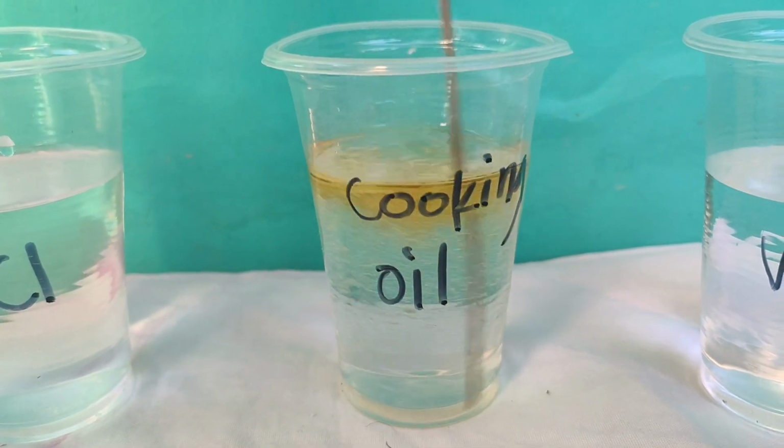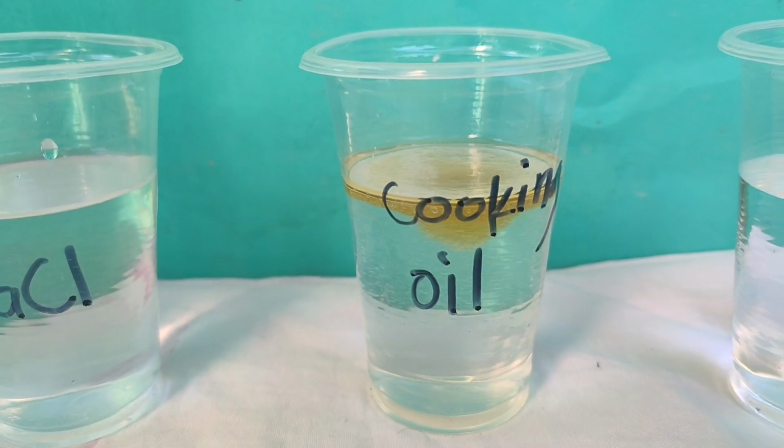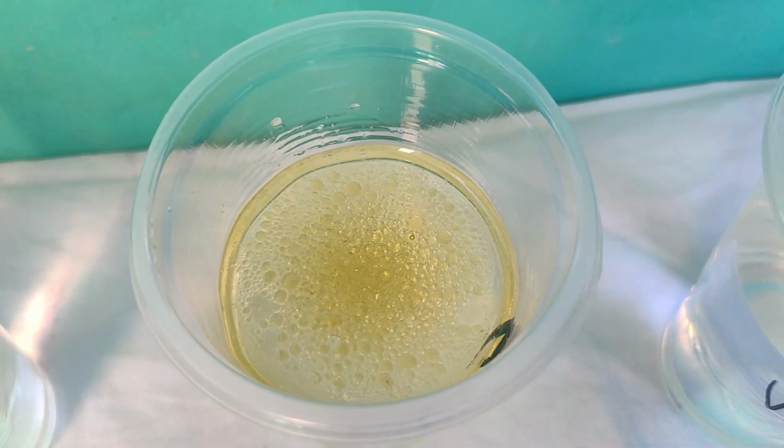The oil is floating on top of the water, and it's creating a surface layer of oil.